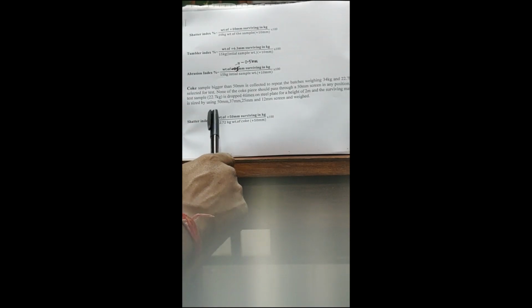In our case we are doing the shatter index, tumbler index and abrasion index of iron ore and limestone. Coke also we can do. For coke, how will we calculate? There we take 22.7 kg. Suppose we want to do the shatter index of this coke.